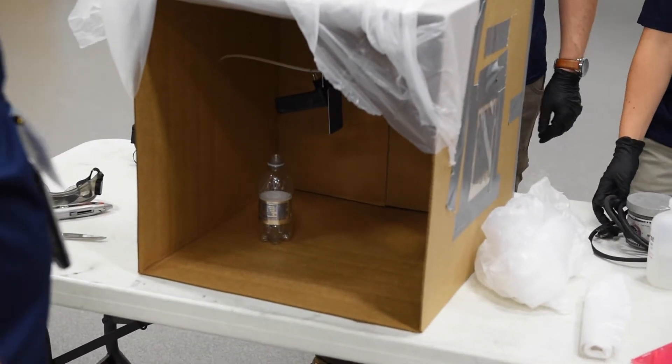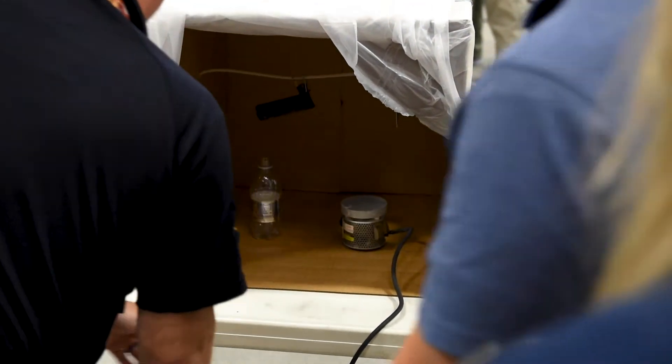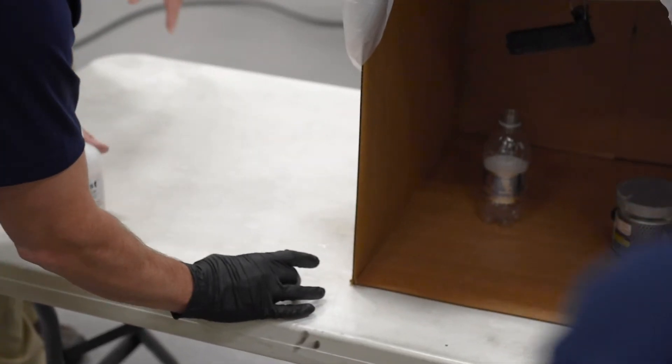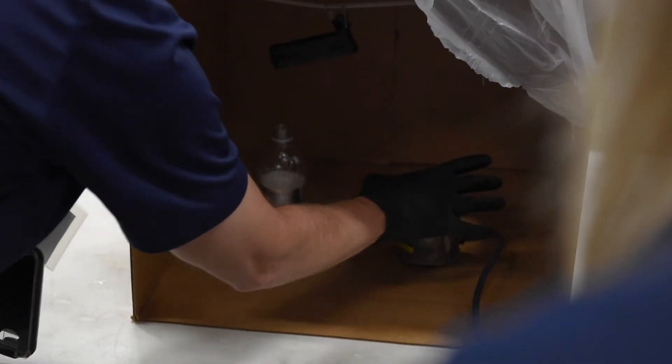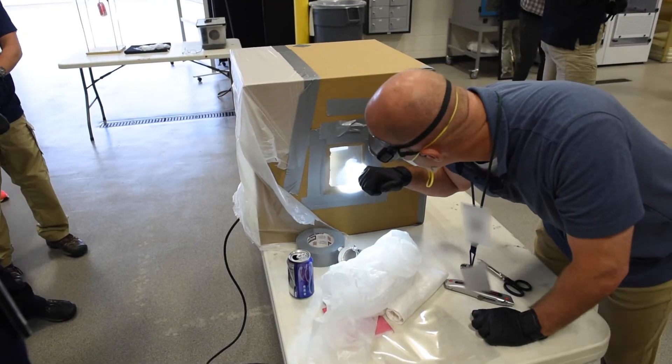We have a chamber to contain the fumes and add heat to it, so it becomes vaporous and flows around all the items and all the exposed surfaces to the vapor. Superglue locks onto the moisture and coats it.